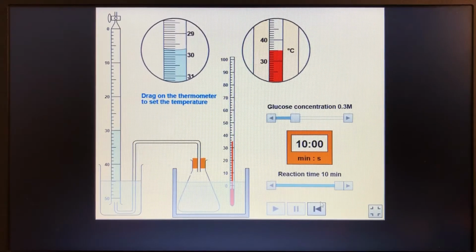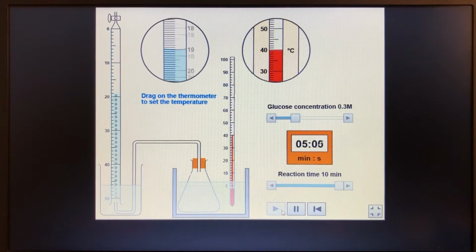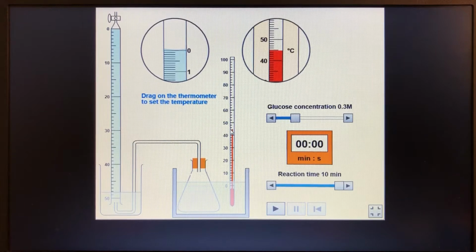29.8. And then they don't like to get too hot because they start to denature. We kind of touched upon that word but not talked about it too much. So we've got 37.5, our biggest score so far. And I imagine, if I'm going to do some predicting, that it should drop now, going to 45 degrees C. And it has to, 29.2.